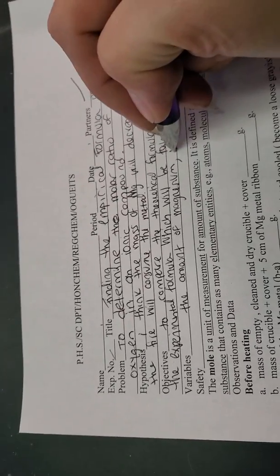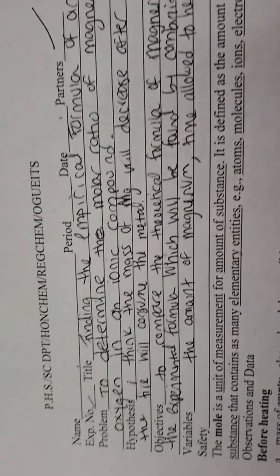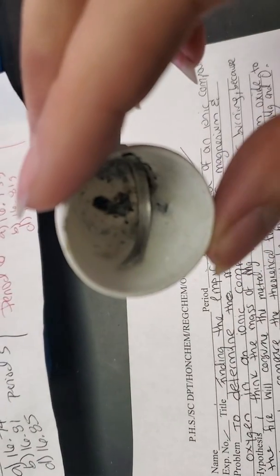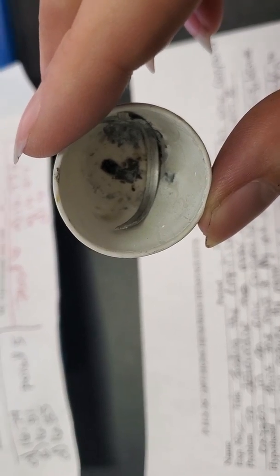The next thing is the time allowed to heat. So the time allowed to heat is another variable. If I allow this magnesium to heat for 10 minutes, the reaction might come to completion. But let's say I only allowed it to react for 5 minutes. Do you think that that reaction is going to complete? Probably not. So the time allowed to heat is another variable to consider.